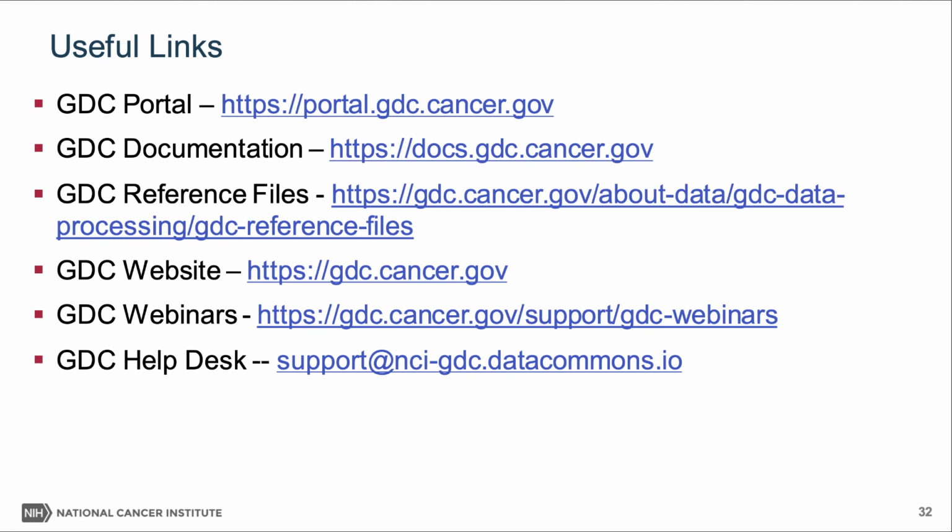And even for legacy projects like TCGA, I think the NCI OCG is trying to sequence more whole genomes of the same samples. So even the legacy project may be updated with more whole genome data. So stay tuned. We will probably release more data on the legacy projects, and a lot of the new projects will have a lot of whole genome data analysis.